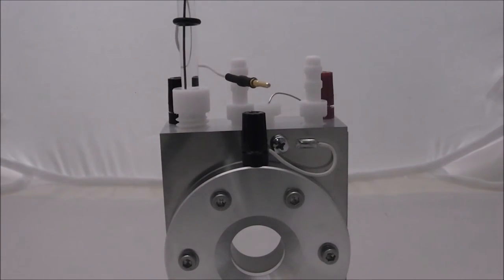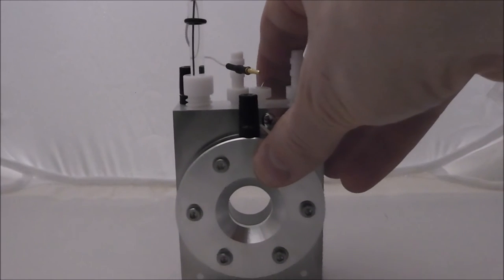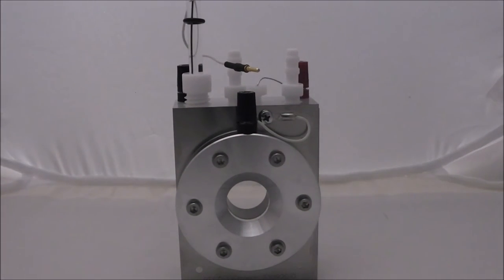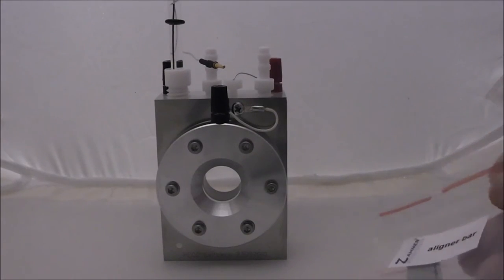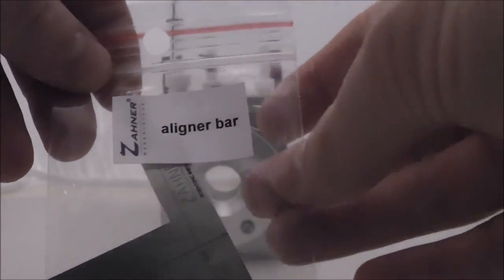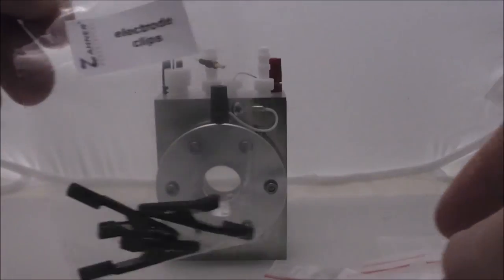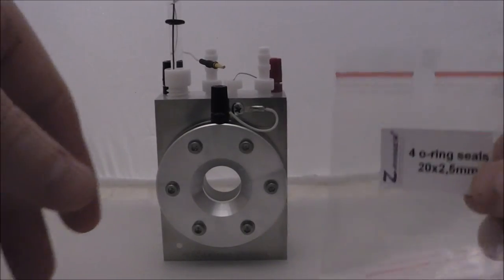So that's the PEC2 cell from Zahna. The nice thing about Zahna is when they ship you the PEC2 cell, they ship you a whole host of accessories, including alignment bars, alligator or crocodile clips if you need them.